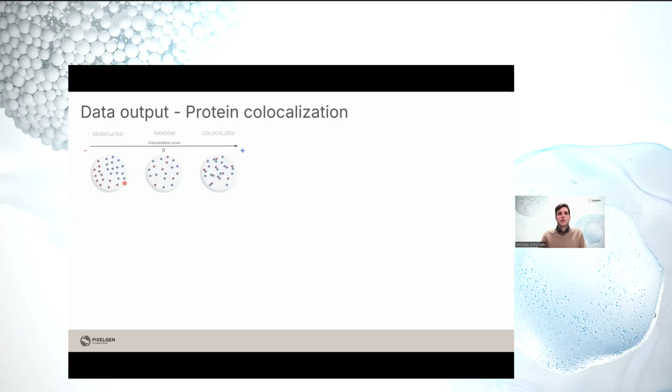And this actually happens more often than we might think. One example is immune cells during migration, which form a front and a back end, and then we can see segregation between proteins. So this is a pairwise measurement, so we will be able to start looking at protein complexes. But if we think that we do this on 155 proteins that are included in the plex, we will be able to identify actually multi-protein domains.